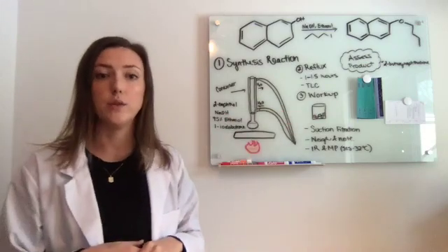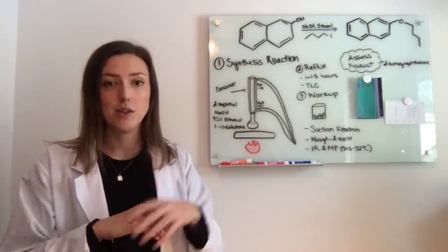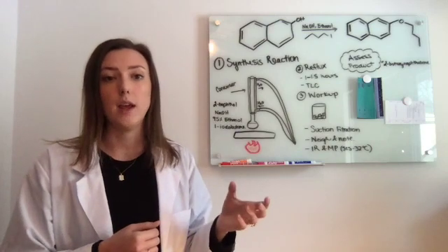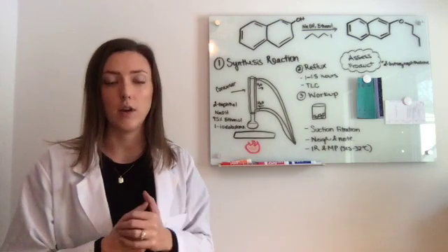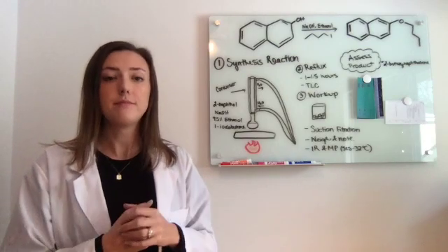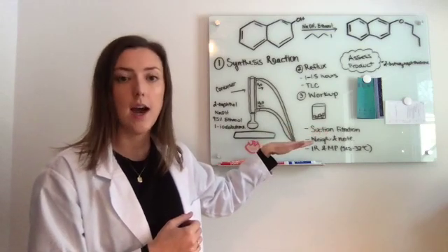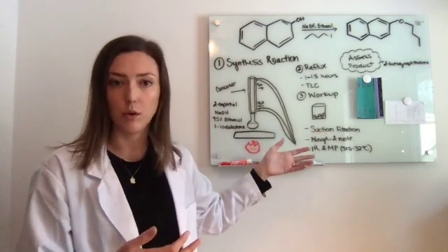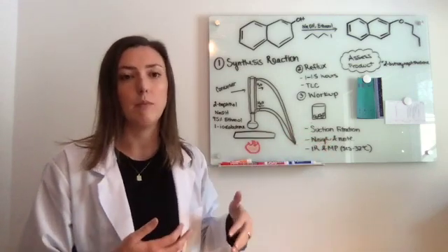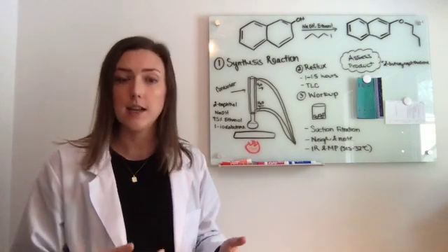At that point, we use suction filtration, where you pour the entire solution. Once it has melted and we feel that all of the solid has exited, we pour it into a suction filtration system, which is another technique that we'll get to in a few moments, and isolate the solid product. At that point, you definitely want to weigh how much of the final product is resulting and note what its physical properties are. These can be compared with, not the weight, but the physical properties can be compared with literature values rather, in order to confirm its identity.